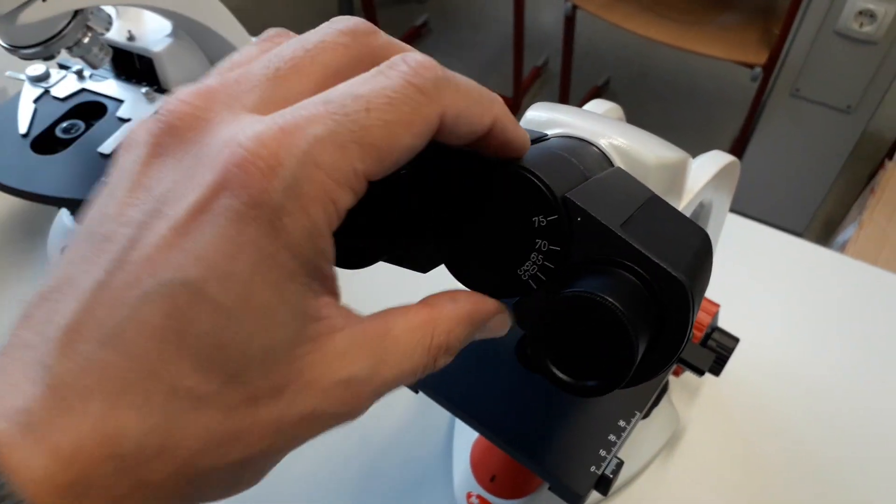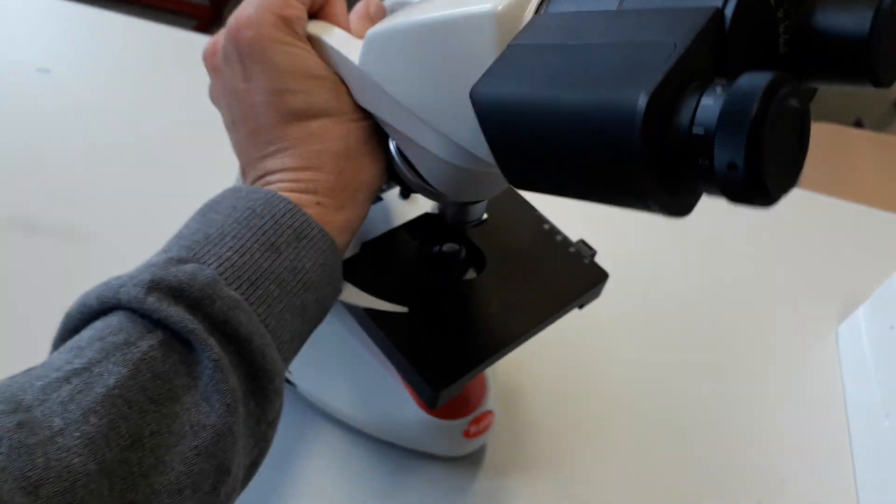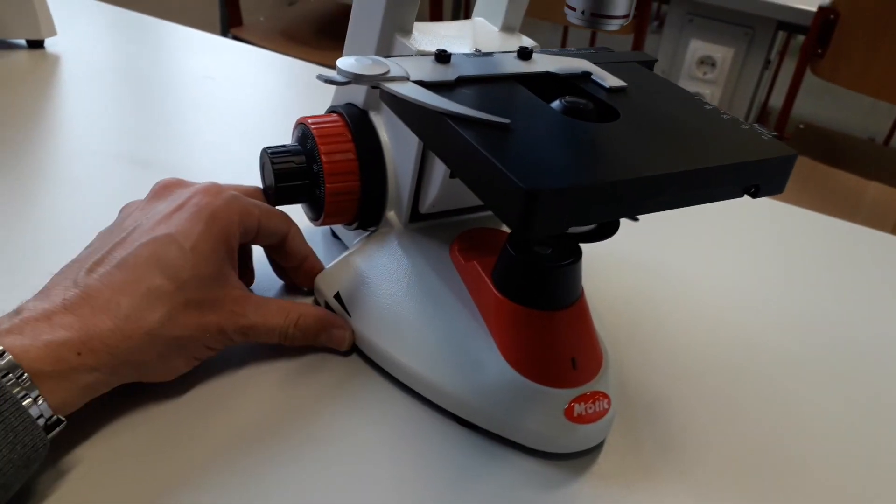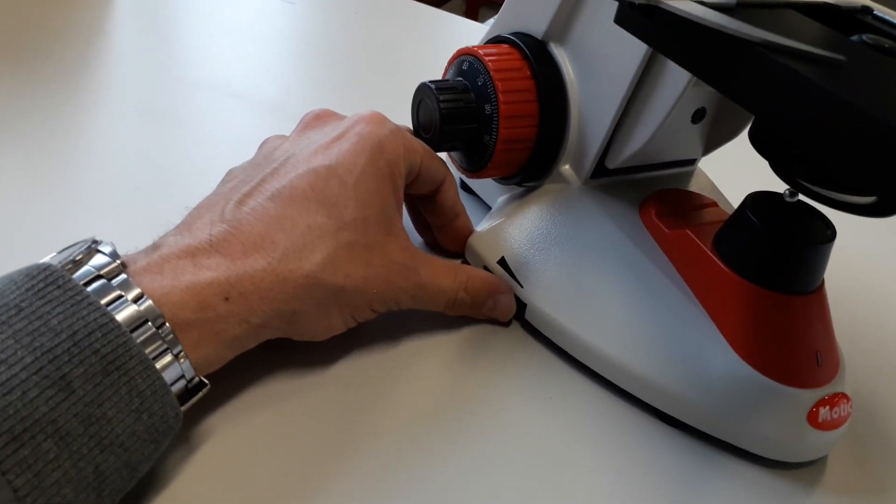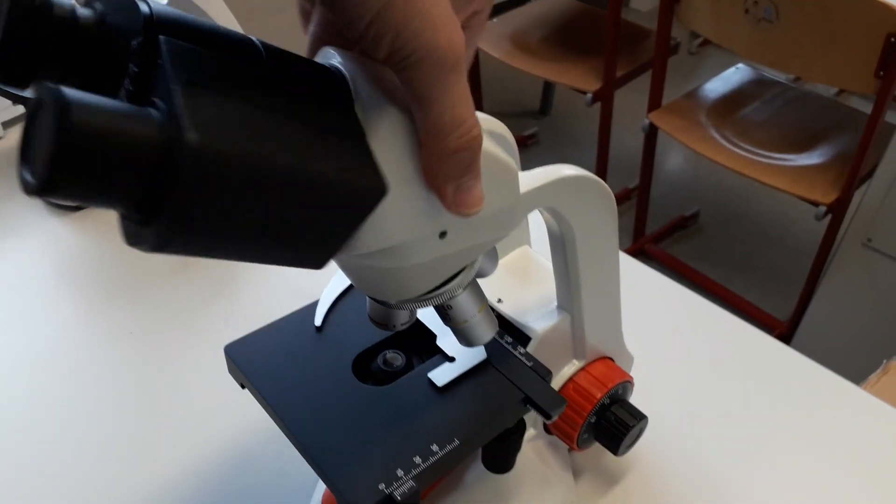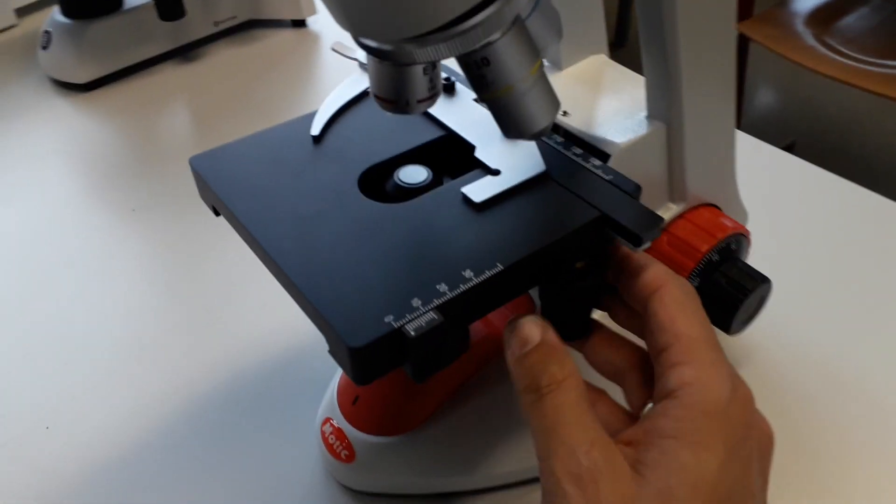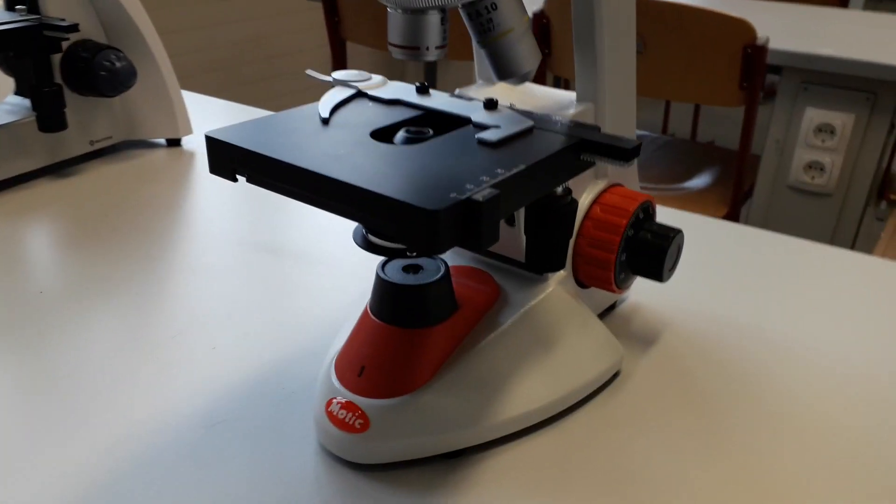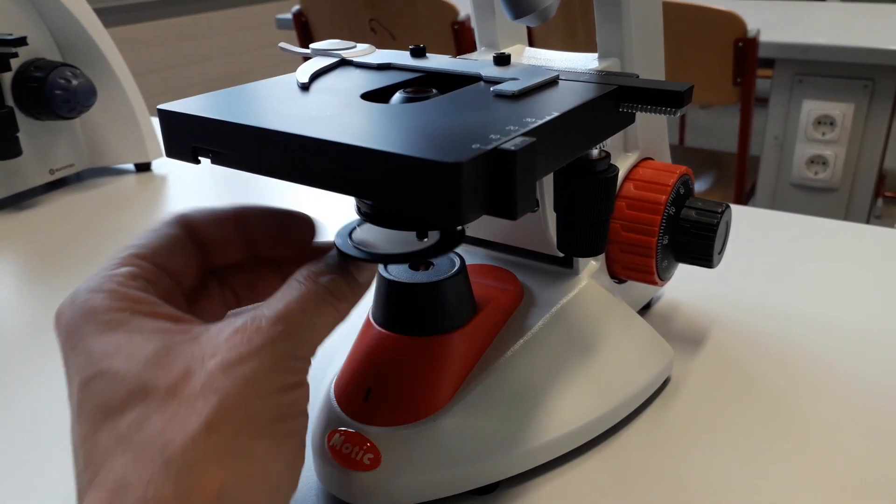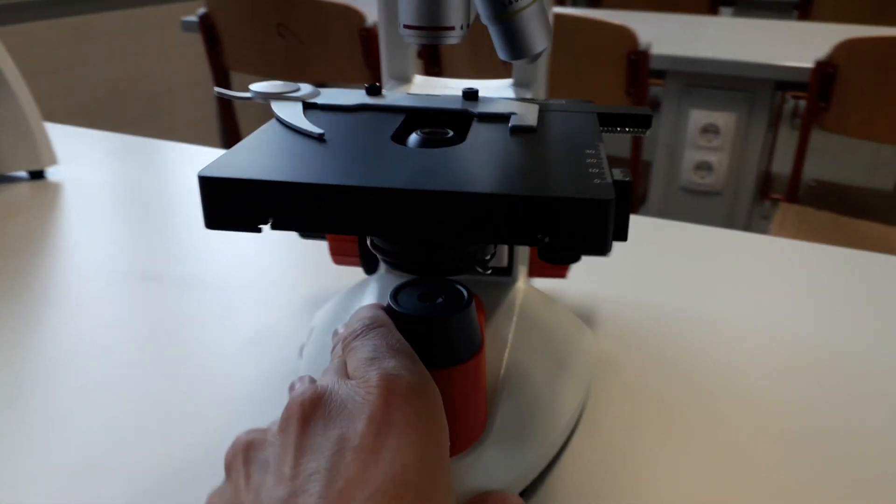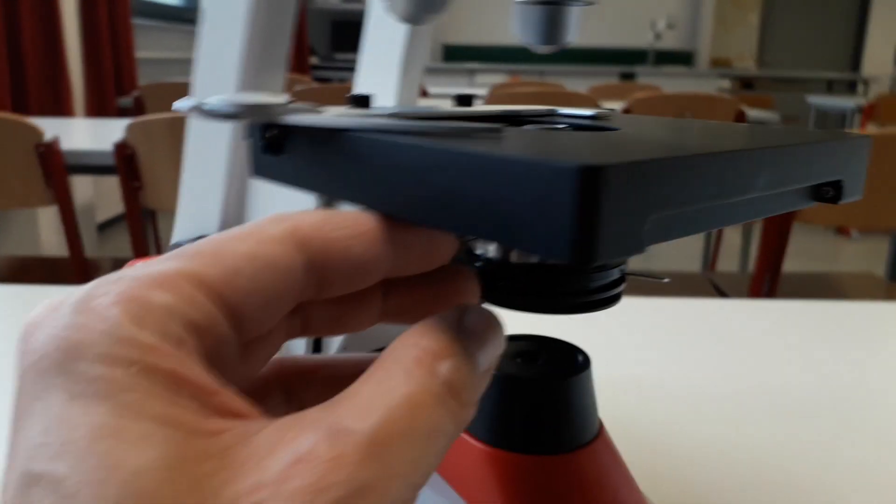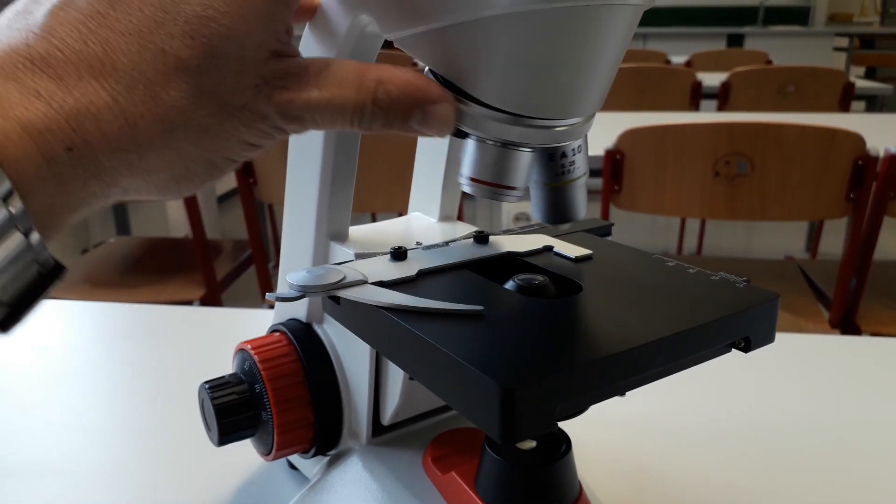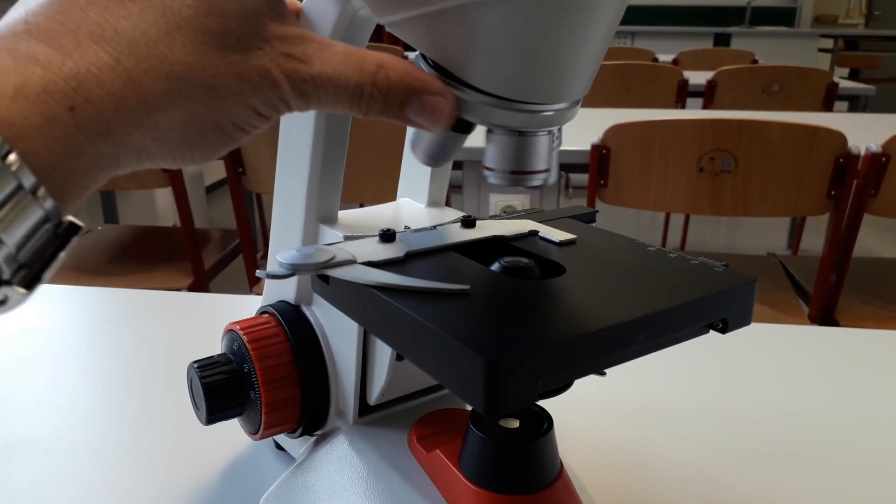There are some caps in here that I have to remove. Also, very nice, honestly. Really, I mean, I'm kind of surprised that for such a reasonable price, that you can get such a quality device. Unbelievable. A few years ago, this would have not been possible. Also, the light intensity regulator, very smooth, very nice. Also, this one here turns very smoothly. Also, again, the mechanical stage, just like before. Ah, this is the reason this has to be removed first. That's why it didn't move. Here we have, of course, also the condenser, filter holder, iris diaphragm is here. How do you raise and lower this one here? There should be a way to... Ah, also, they also have a lever here. See, this one is the way how you raise and lower this one here.